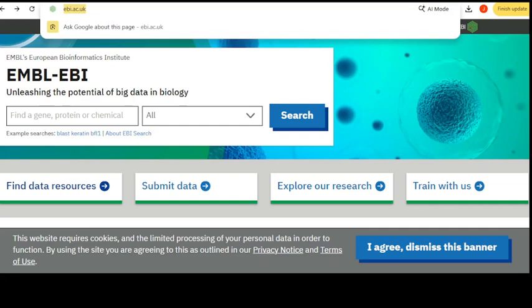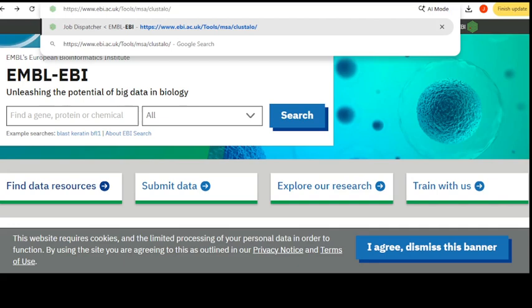Meaning the matching part has to be aligned with the matching part from the other sequence or of the other species. If you don't have that, the phylogenetic tree is unable to create the tree for you. So here I have copied a sequence for you. This is the easiest one, even if you don't know this one.